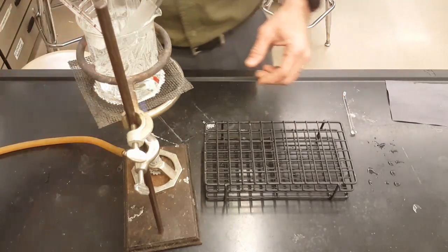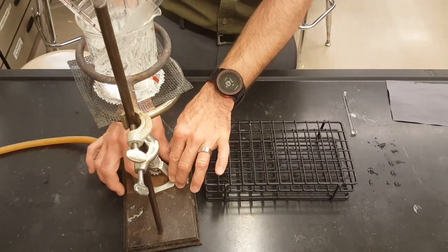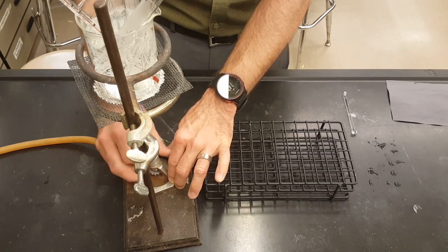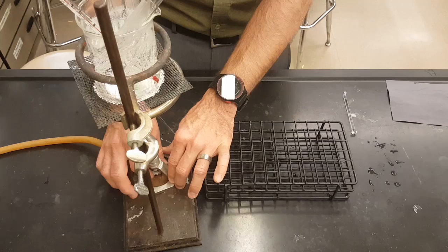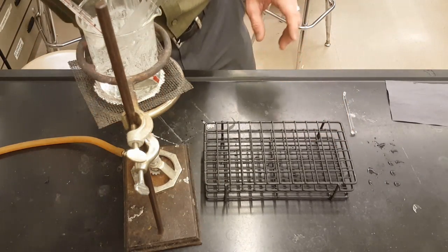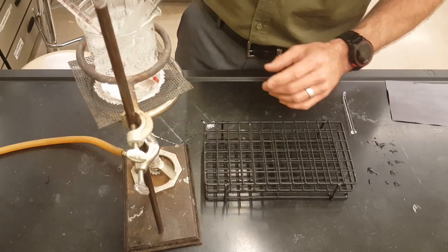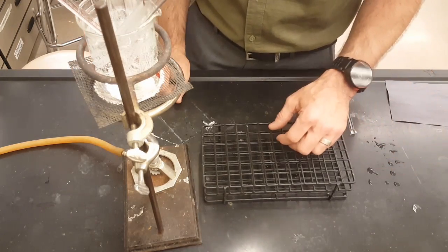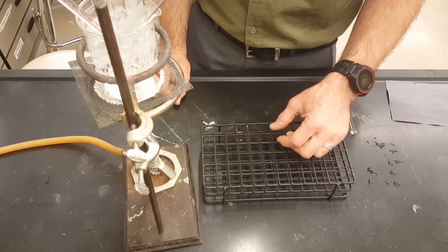I'm really close to boiling right now, so I'm going to turn down my flame. Oh, that's nice. You don't want to boil. If you're close to 90 degrees, you can even turn your Bunsen burner off and watch the thermometer and keep it in between 90 and 95. Something like that would be really good.